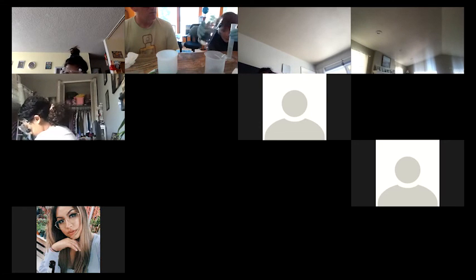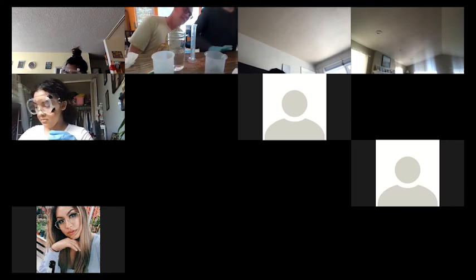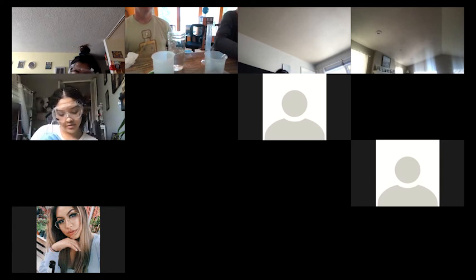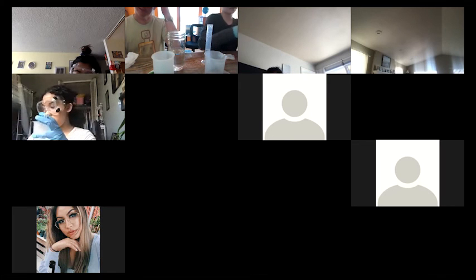Does the amount of water have to be exact? No, not at all. That's pretty good. You're rinsing it without the filter first, right? Yes, we're just rinsing it in the beaker, and then once we've got all the stuff in the filter, we'll rinse it a couple more times.